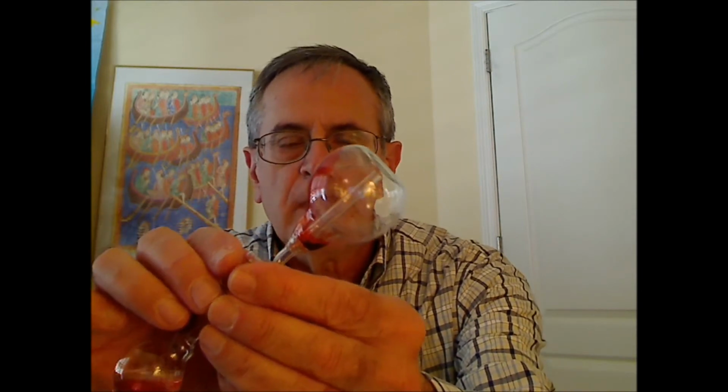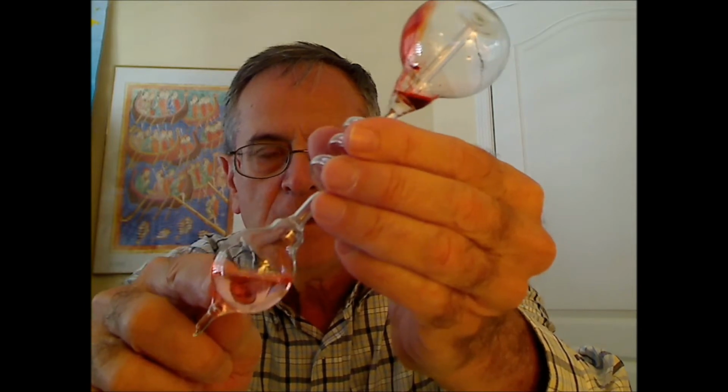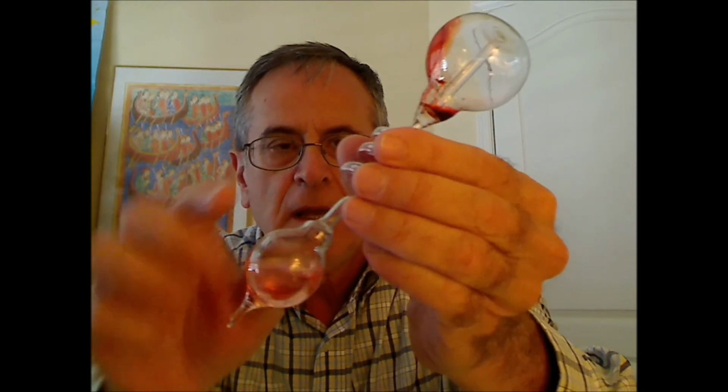Okay, well, here we see the result of our simple distillation demonstration. You can see that the dye that was originally in the solution is in this part of the apparatus, and the essentially clear liquid that has been distilled is in the bottom, or this part of the apparatus. So this is a very simple demonstration that illustrates distillation.